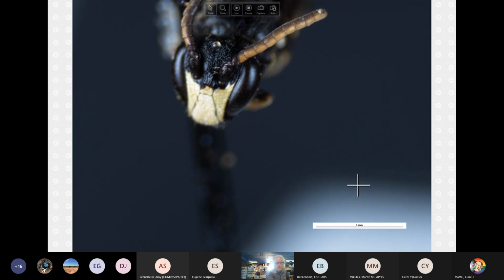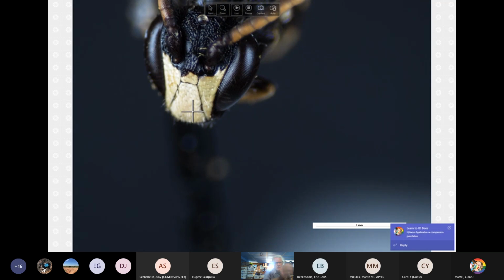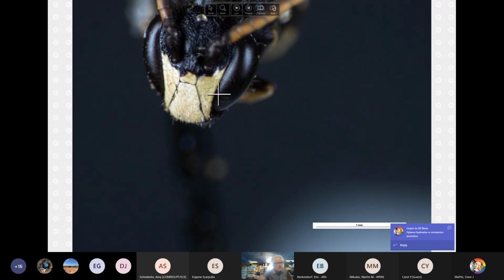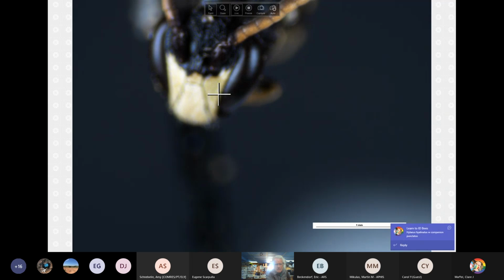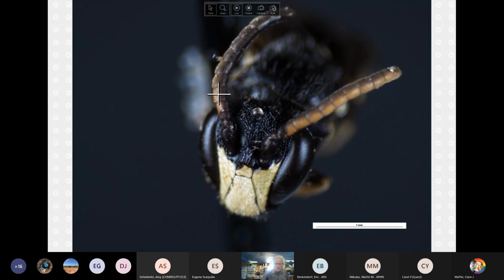You can even see this right now. See how the pitting on the clypeus and the paraocular areas is much rougher than on the other ones, if you were paying attention. We're looking at the scape here again. I'm going to jack up the lighting. Let me get that going here.